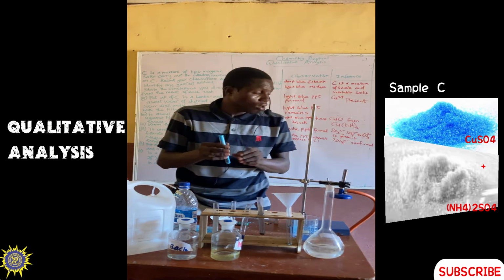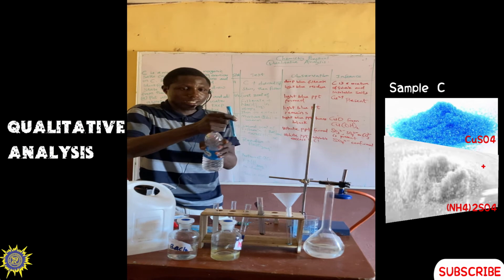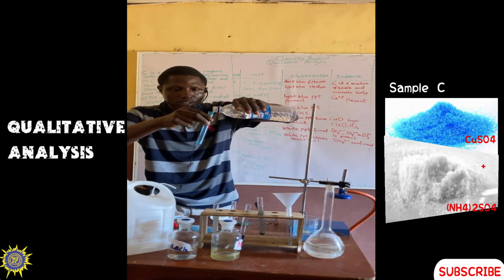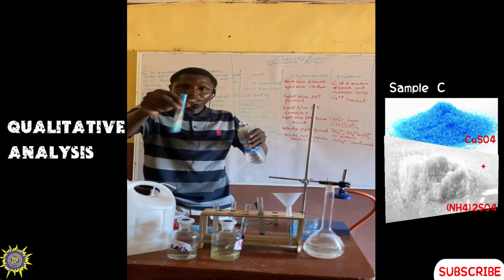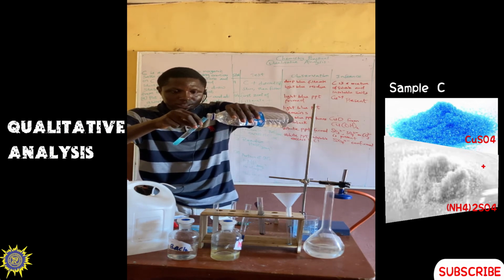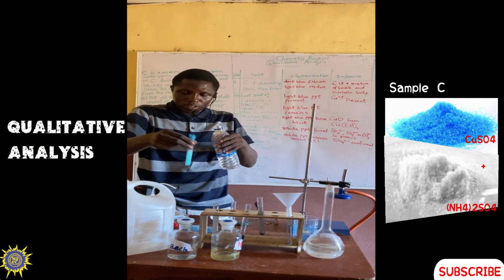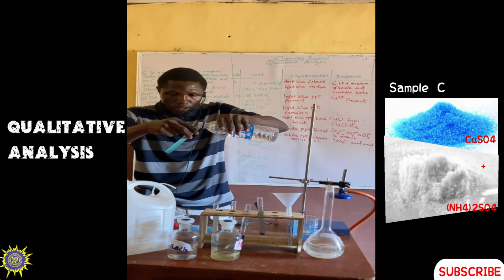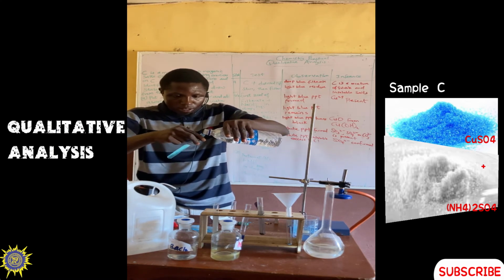So now to that residue add HNO3. What happens when we add HNO3 to it? There's effervescence. You can see there's effervescence taking place. So make sure you rinse the side.